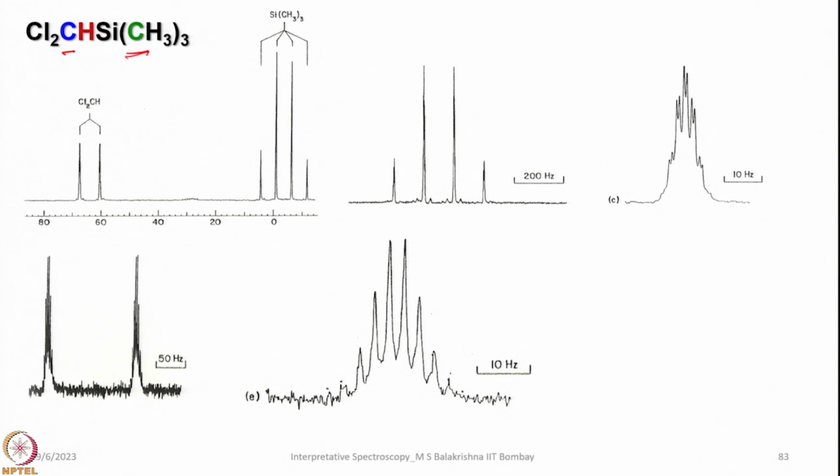Simply by looking into the coupled spectrum, this 13C will couple with H and show a doublet, and then for this carbon here, all 3 are equivalent. As a result, we can anticipate only 1 carbon signal. So, you can see the coupling with 3 protons. It will appear as a quartet.